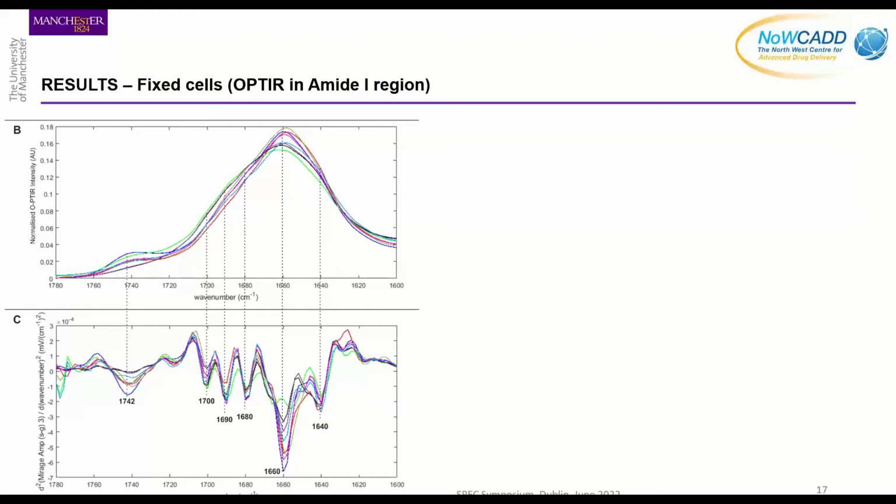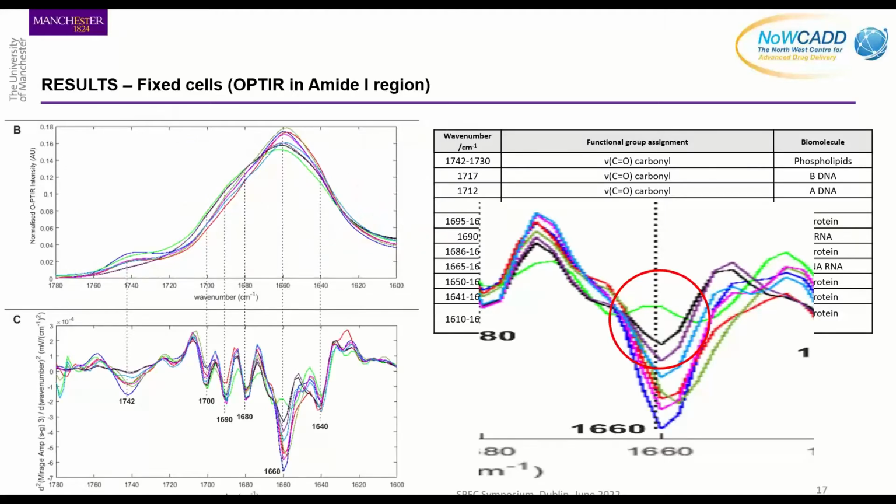at the second derivative, you do get very clear and very consistent data. You can see here these are perfectly consistent, and we get the same peaks every time. We were worried how much of this variation is reliable. Can we rely on that data? Turns out we absolutely can. I was quite surprised, and this is all completely reproducible, and it shows you that certain things are changing very quickly in the amide 1 band.